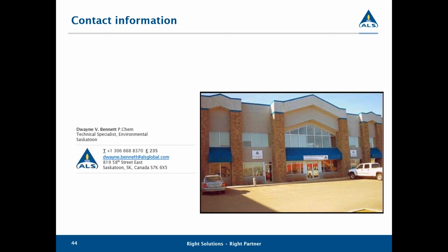Go ahead, Carl. I'm just wondering, have you ever heard of anyone using particle size analysis to estimate the hydraulic conductivity? I have heard of certain engineering firms that do use the particle size analysis in the hydraulic conductivity estimations, yes. A lot of those types of applications are done by geotechnical engineers, and yeah, I do know that there are people that use that for that application, yes. Okay, cool, thanks.